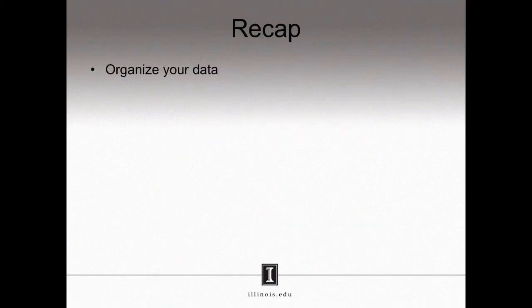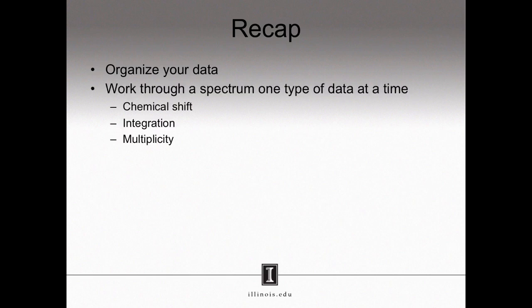That brings us to the end of this webcast. To recap, the most important thing you can do when interpreting NMR spectra is to organize your data. This process begins by working through a spectrum one aspect at a time. Label your signals in the NMR spectra, and then identify their chemical shift, their integration, and their multiplicity. With that information in hand and organized, it will be easier to see how all the different pieces fit together.